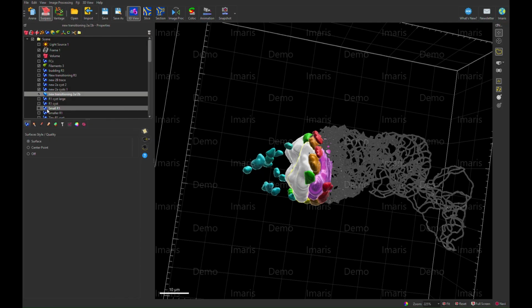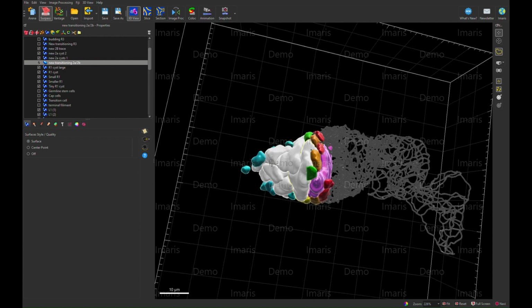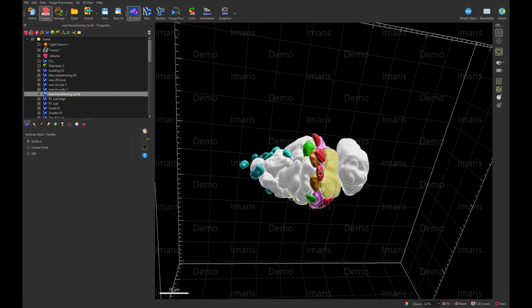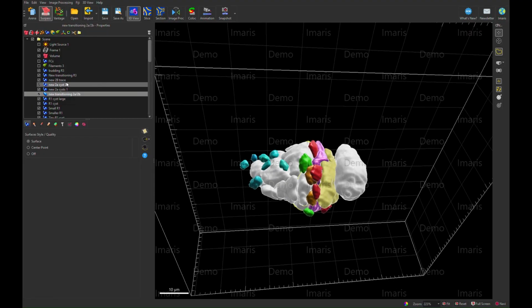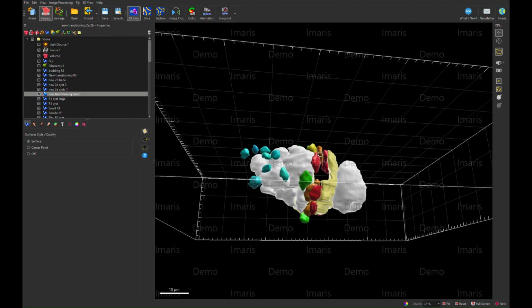Okay. And then we have the much smaller region 1 cysts that I'm going to put back here as well. See what those look like once more. And there we have the region 3, clearly encapsulated by the Fas3. And the transitioning region 3 there in yellow. You can see how it's rounding up as well, in that bowl-like shape before it balls up like the region 3.